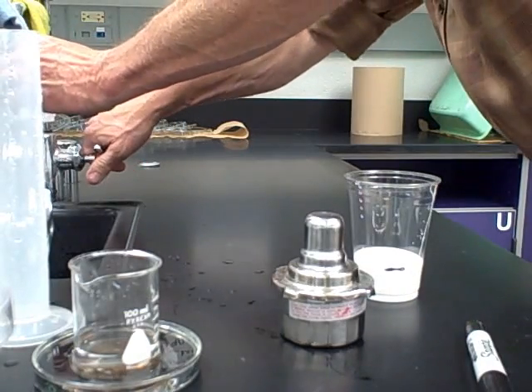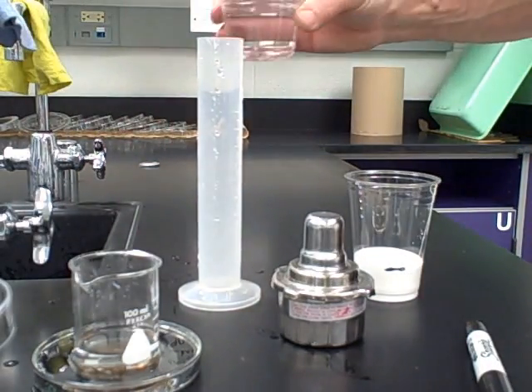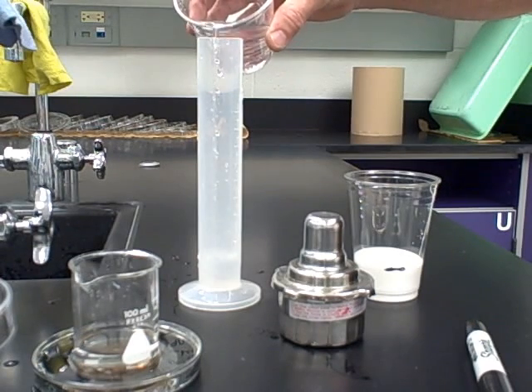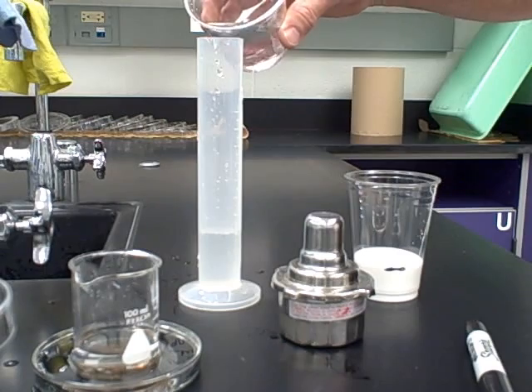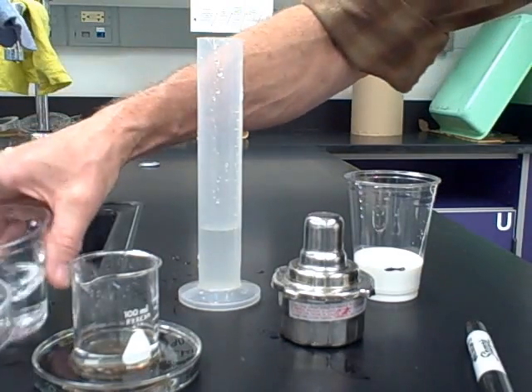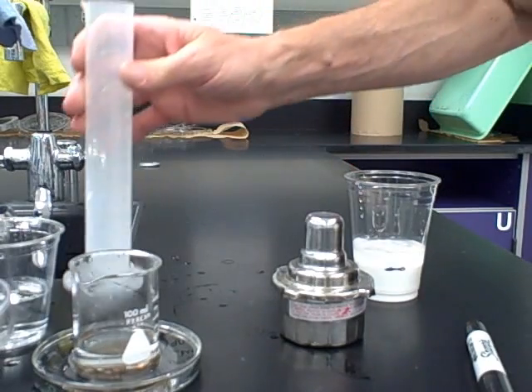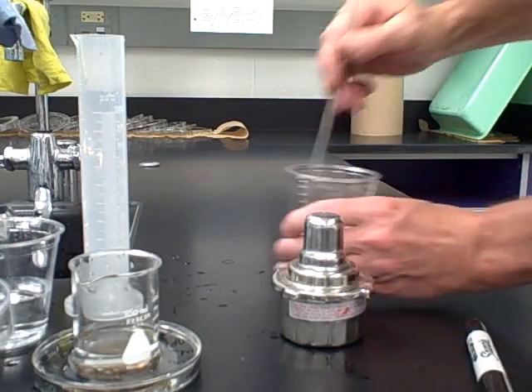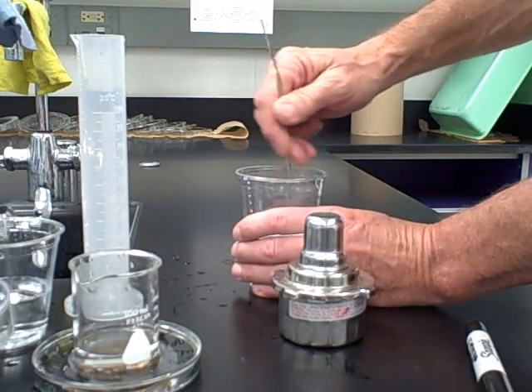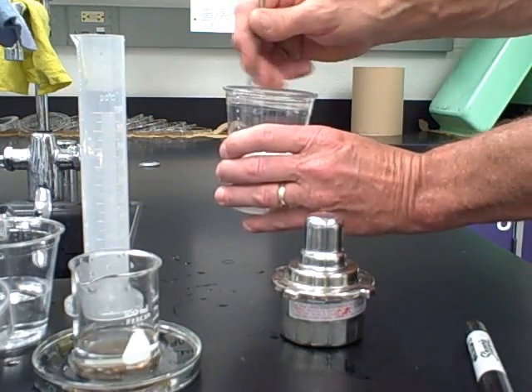Now we have 60 milliliters of white glue. Measure out 30 milliliters of water — someone should be doing this step while the others are measuring borax and heating that solution. Pour the 30 milliliters of water into the white glue to dilute it, then stir with the micro spatula until evenly mixed. We want the glue to be kind of soupy.